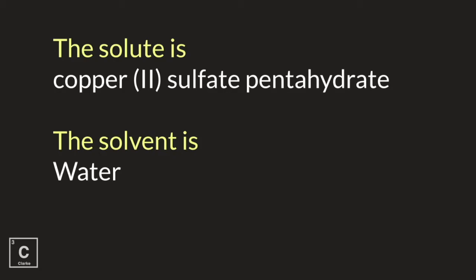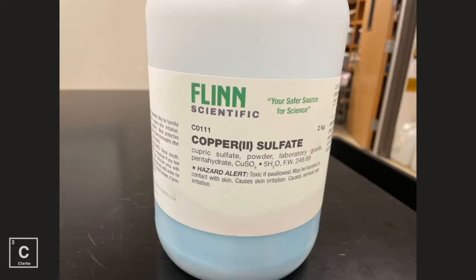And we're going to use water as our solvent. Do we see that? Copper sulfate pentahydrate. Five waters.